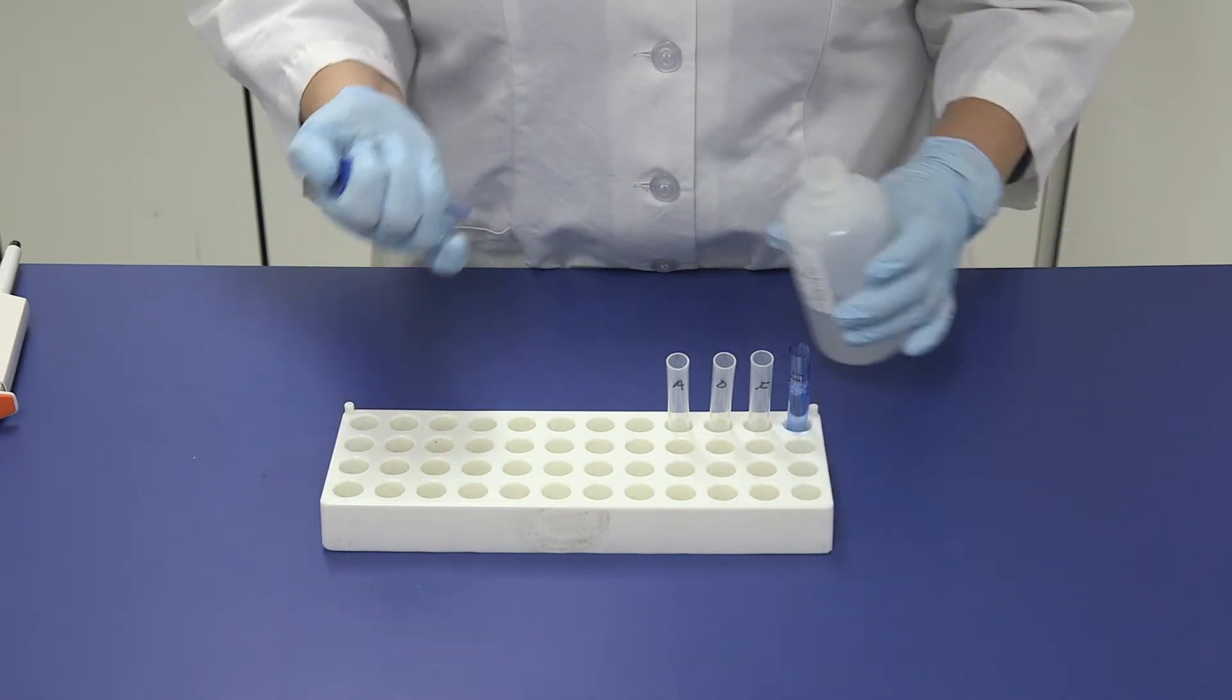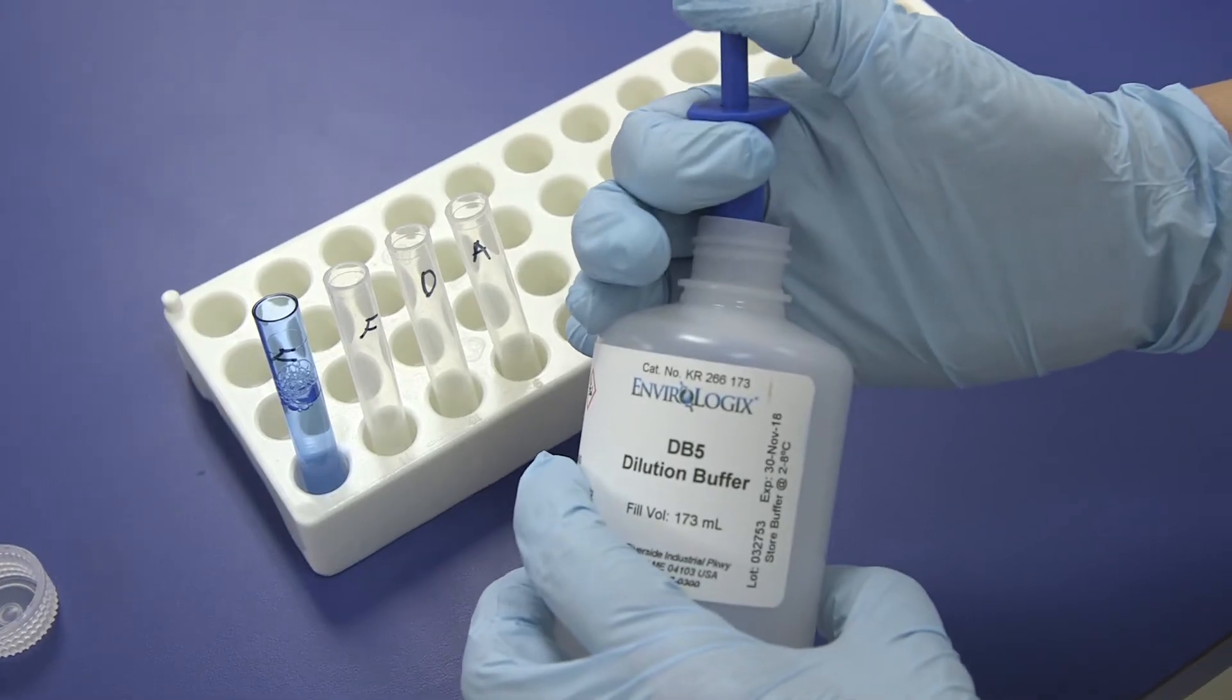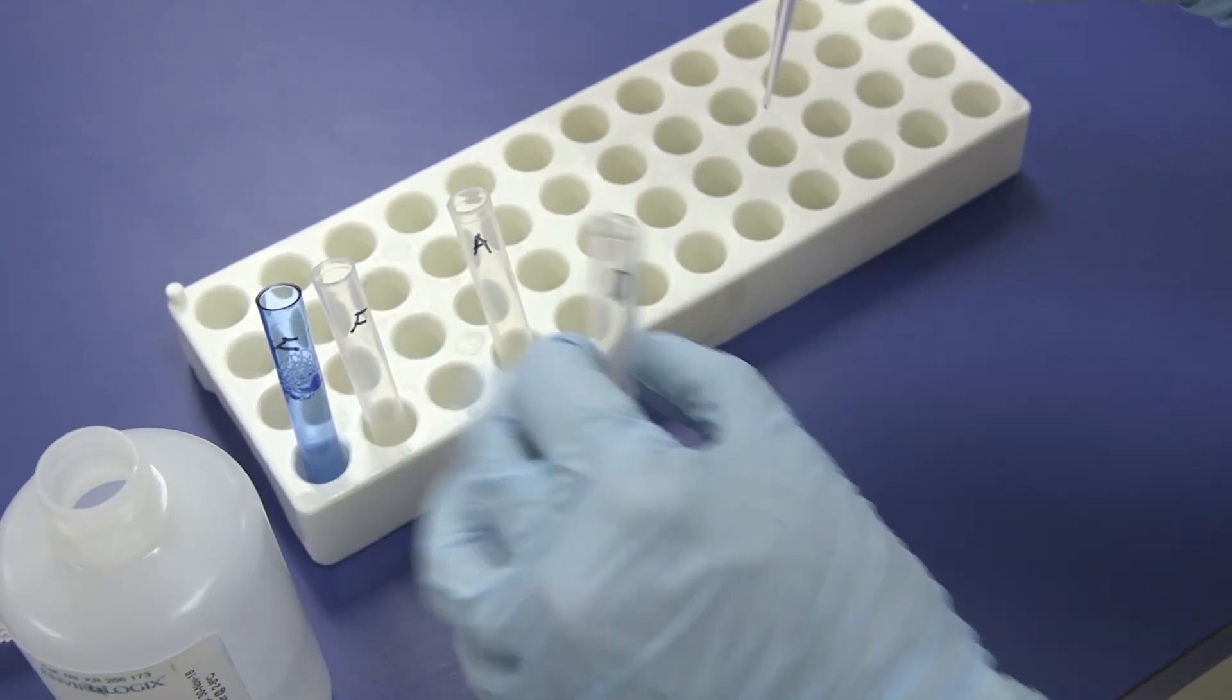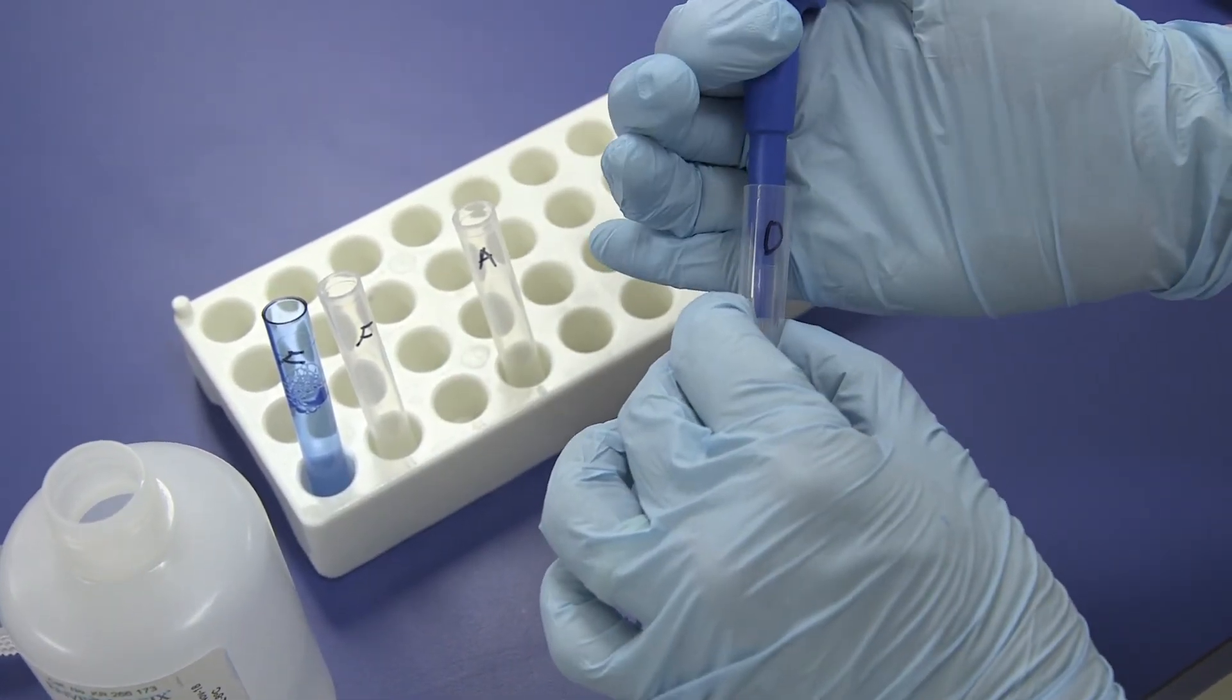Add one pipetteful of DB5 to the clear reaction tube labeled D and one pipetteful of DB5 to the clear reaction tube labeled A.